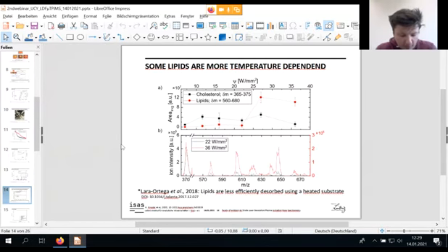Another interesting point was that cholesterol is desorbed at a quite low laser intensity, so we use it as a kind of gold standard for our measurements. However, with other lipids at higher masses, the threshold was higher. But again, this is not a mass-dependent effect, but must be related to the topological area or other factors of the compound.